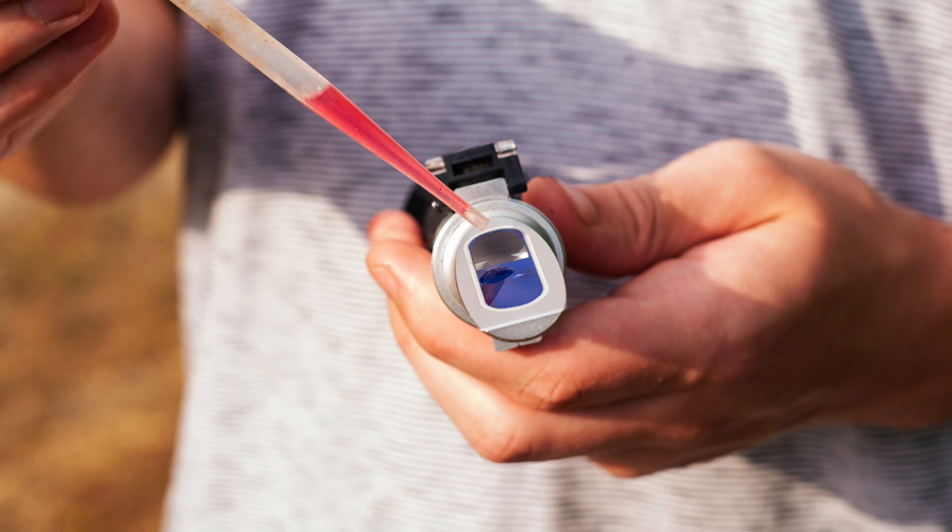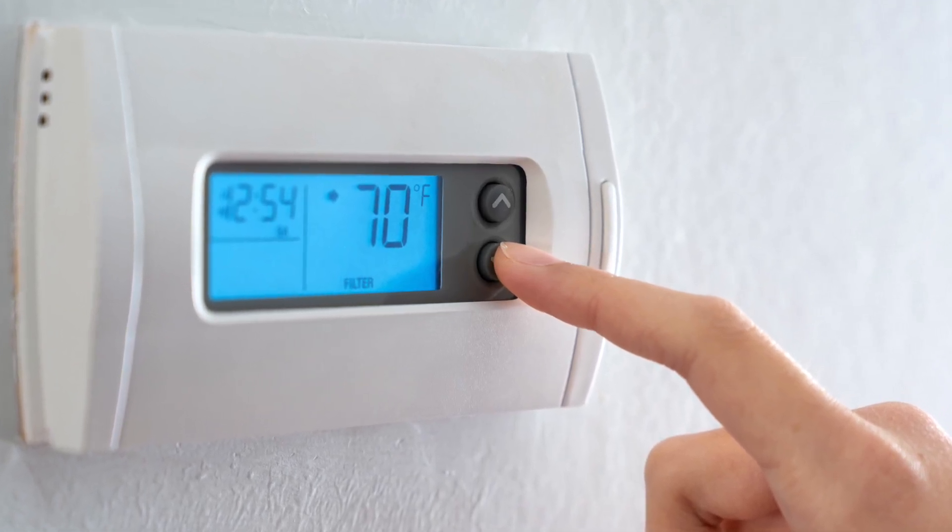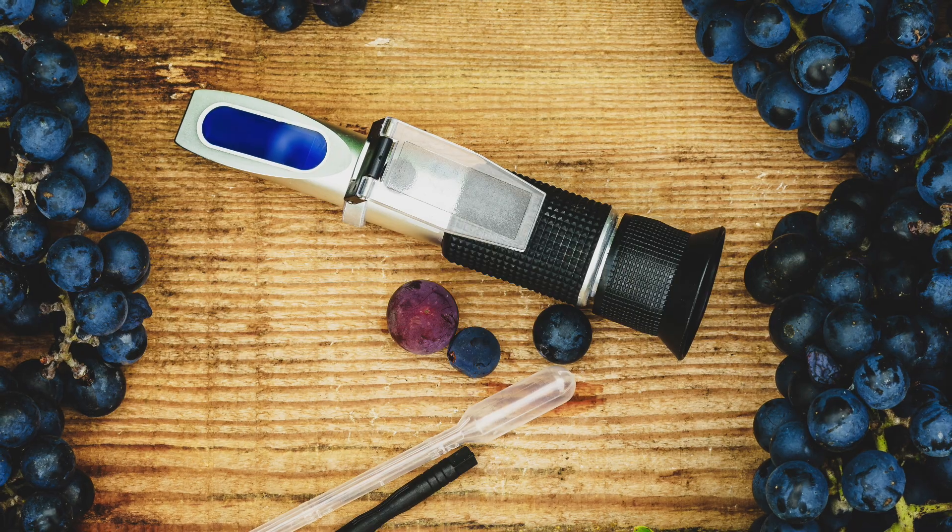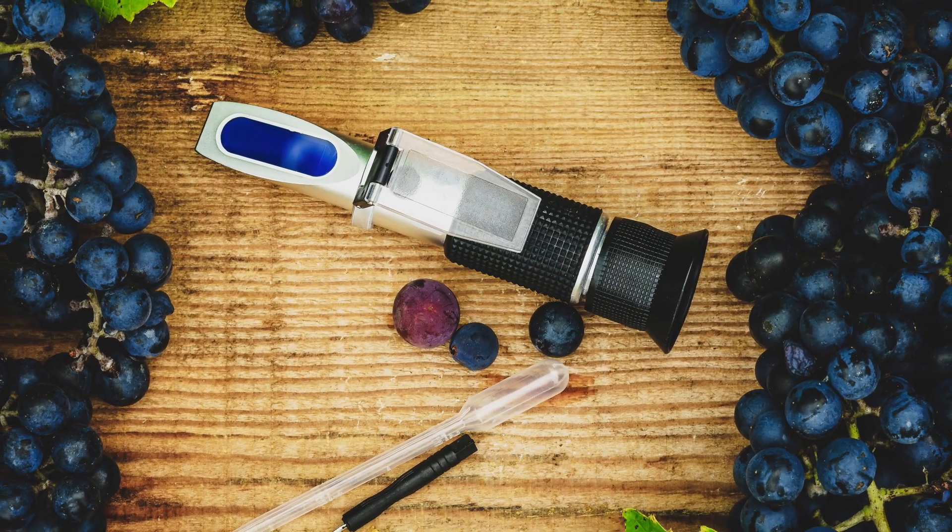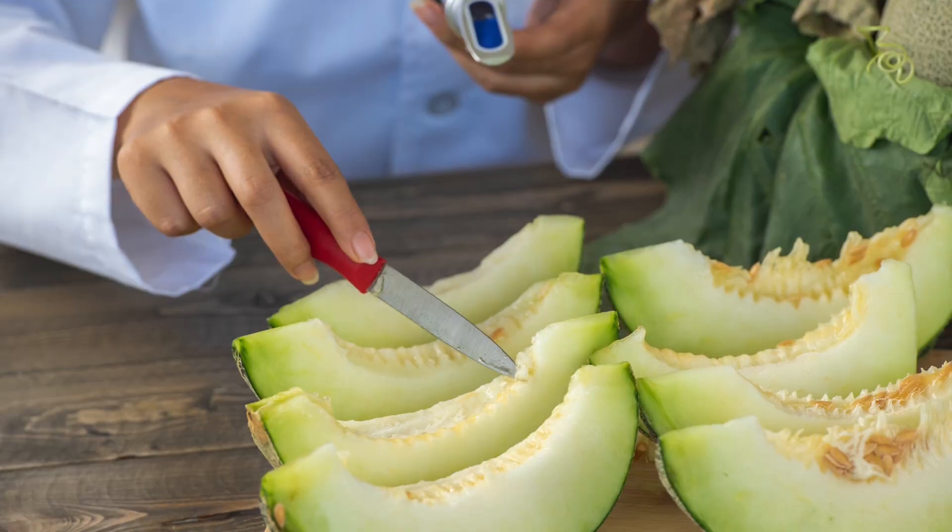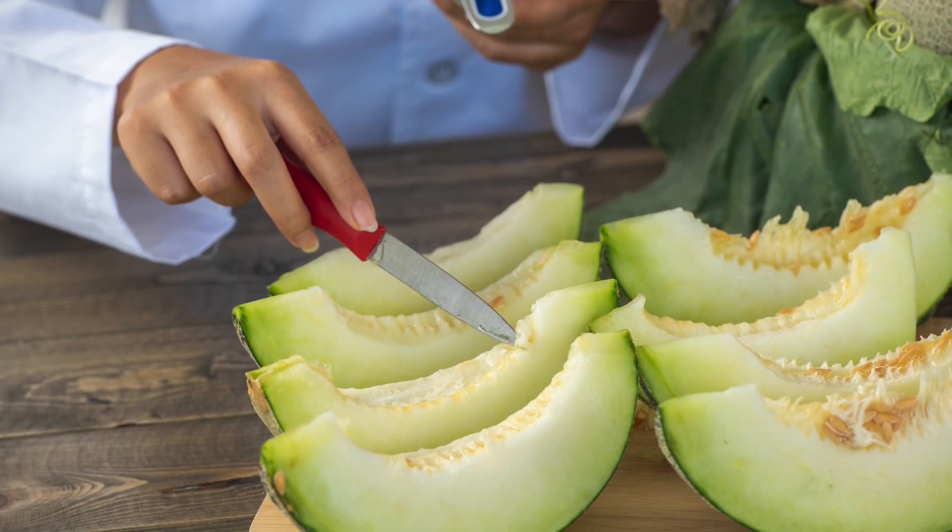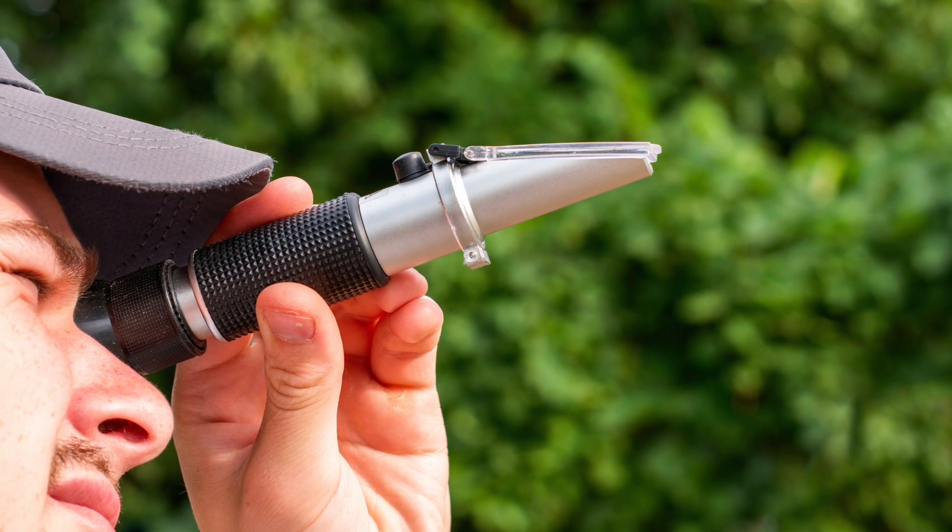Temperature can influence the accuracy of a refractometer. It is often recommended that samples be allowed to come to room temperature before measurements are taken. Unfortunately, room temperature may vary season to season as well as location. Therefore, purchasing a refractometer that has automatic temperature compensation is a good way to minimize temperature-induced variations in measurements.